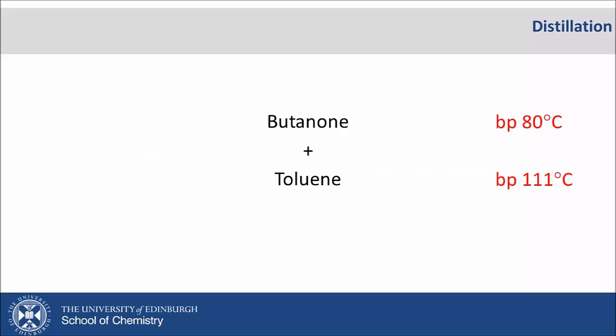The distillation I will carry out is that of butanone and toluene using QuickFit P14 glassware.